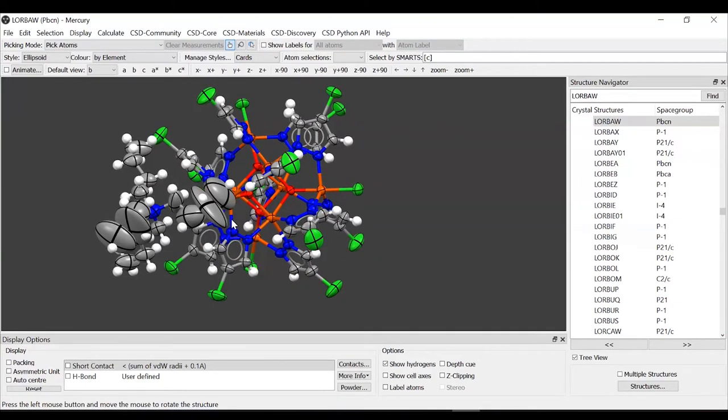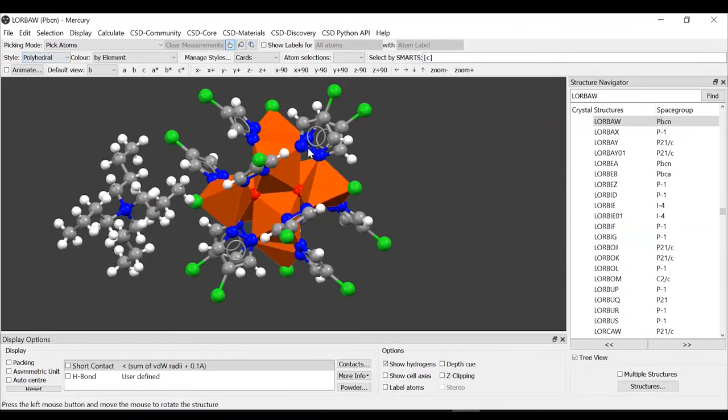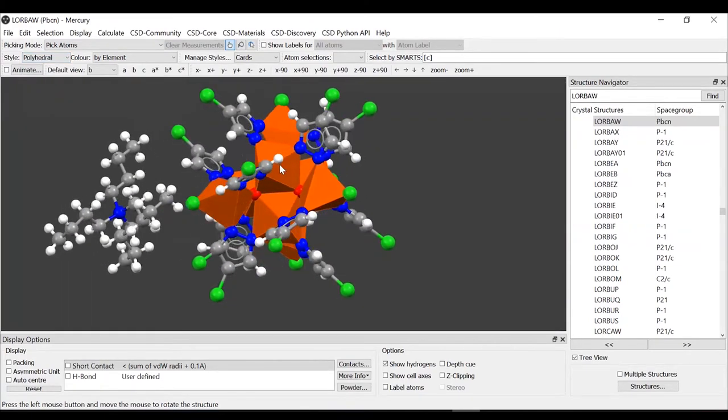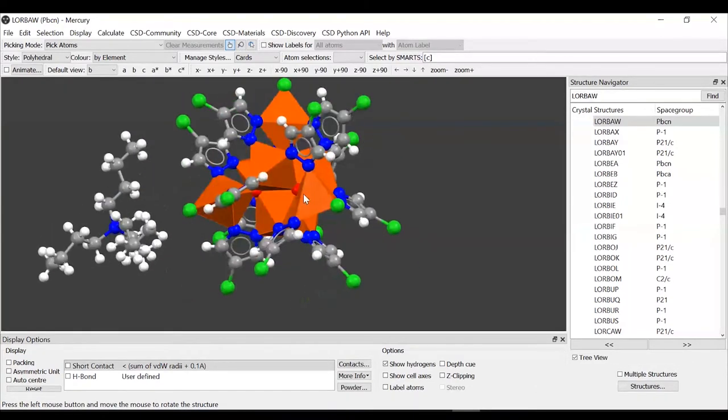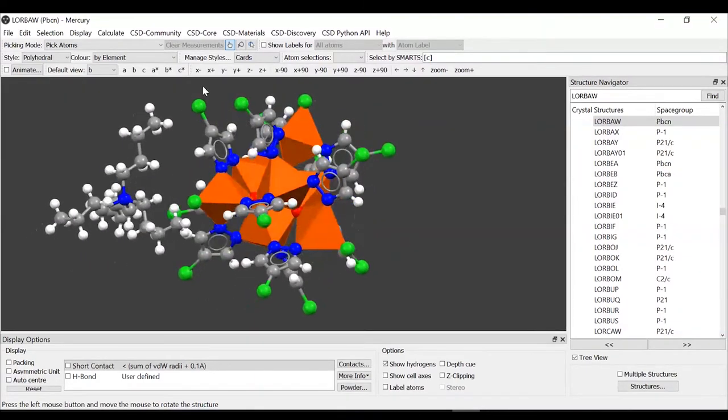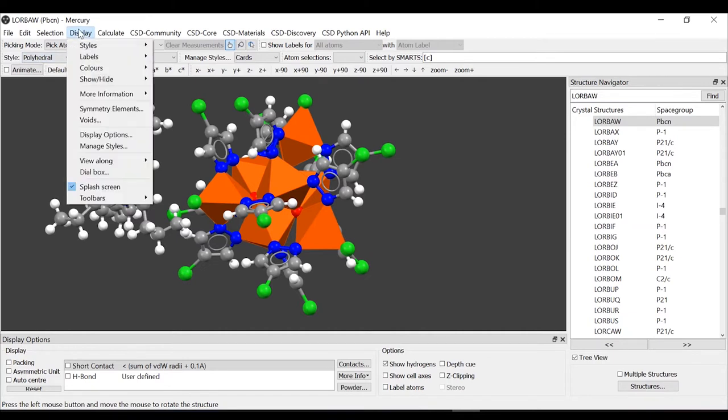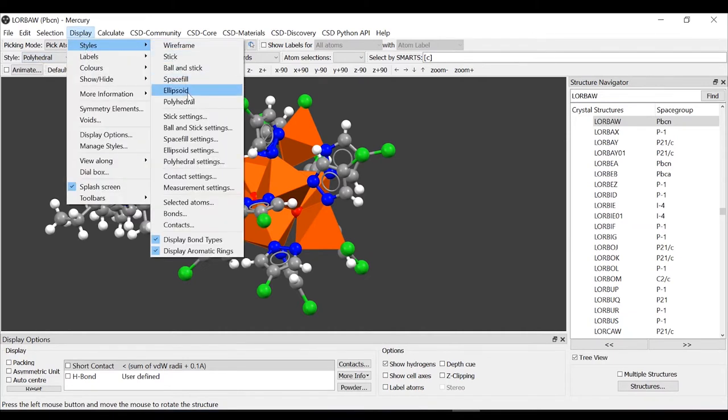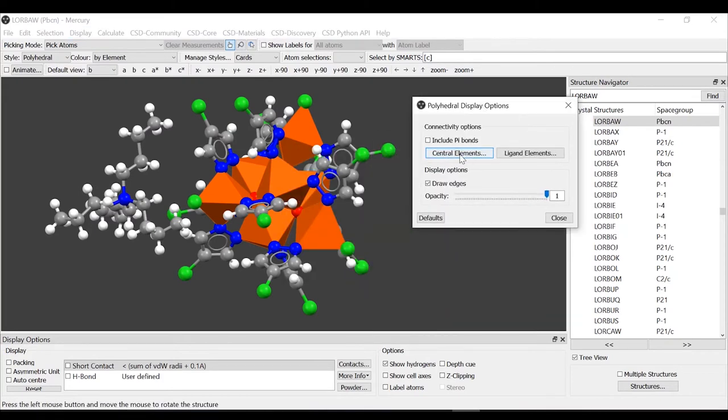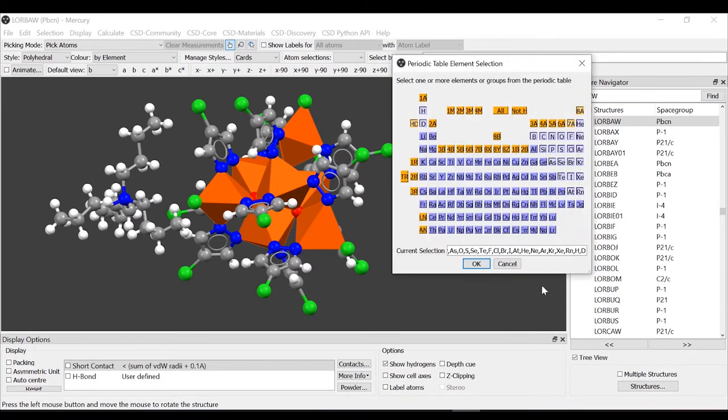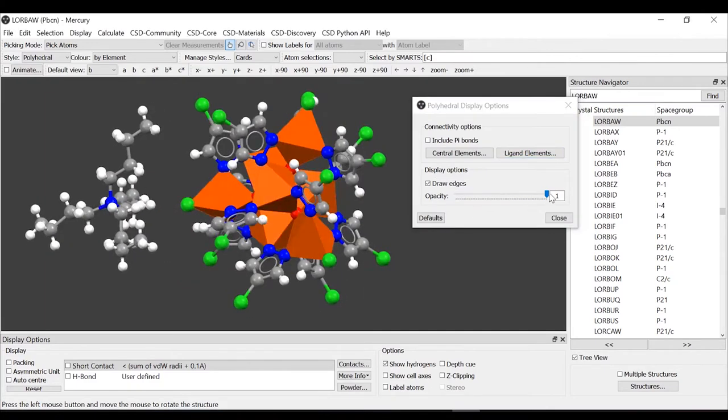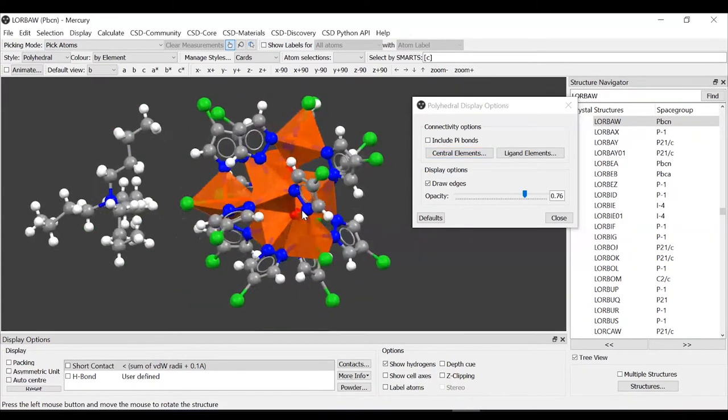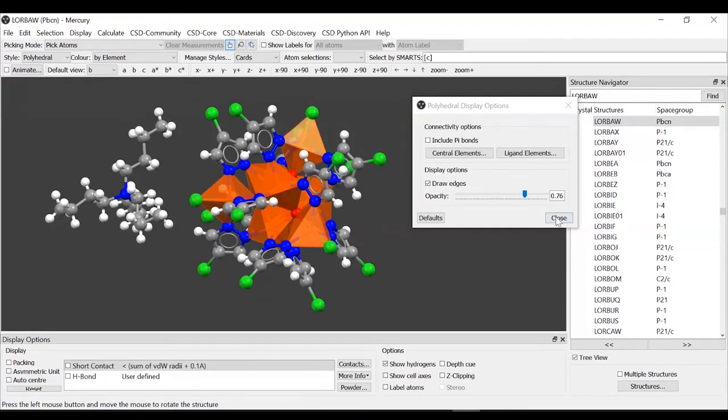We can also use this structure to see a different style, which is the polyhedral style, which as you can see represents polyhedra around the iron atoms. You can also in this case edit the settings. We went to style polyhedral. For the settings, we go to display styles, polyhedral settings. Here you can learn and edit which are the central elements for the polyhedral. We have our list here. Again, you can do it for the ligand element. You can decide about the opacity of the polyhedral and whether or not you want to draw the edges.